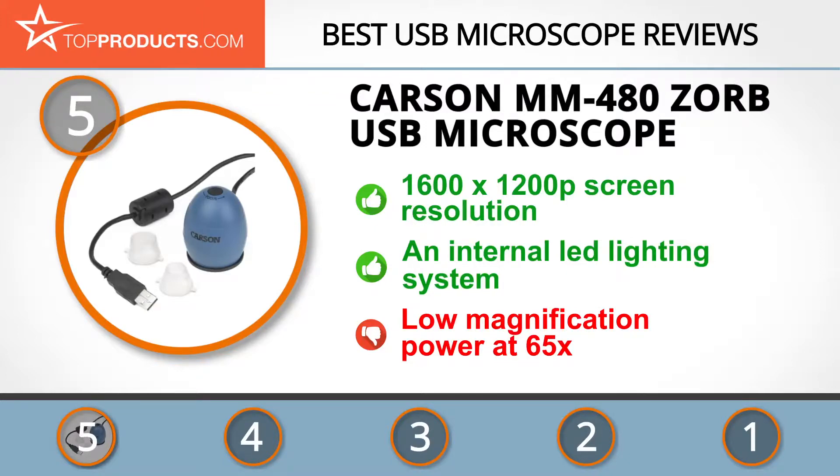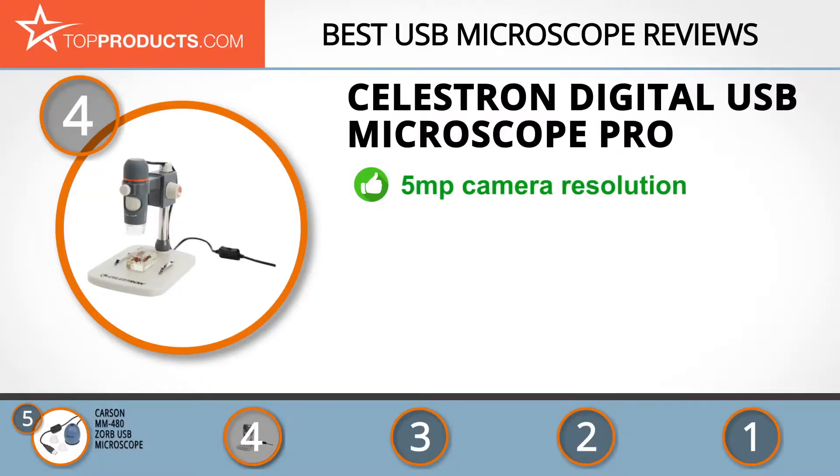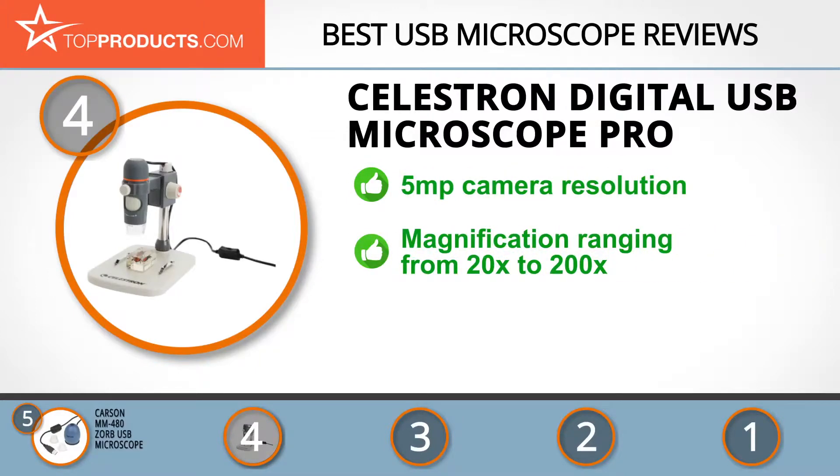Next on our list at number four is the Celestron Digital USB Microscope Pro. Being among the leading brands in the optic industry, Celestron manufactures and distributes quality products designed to meet your needs. Its handheld digital USB microscope boasts a 5 megapixel camera that allows you to capture quality still images and live videos.